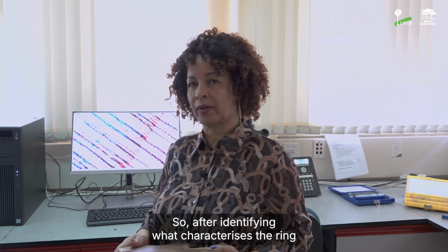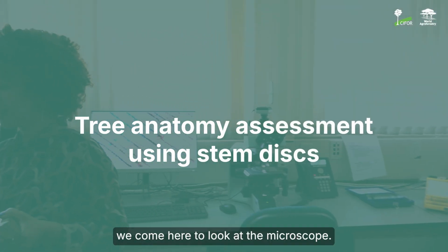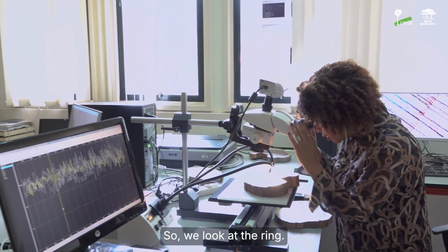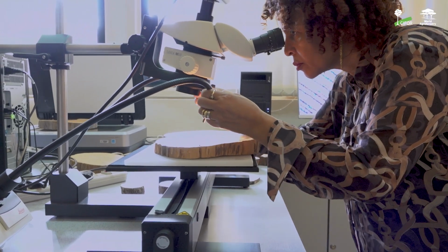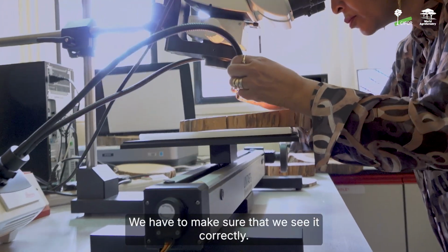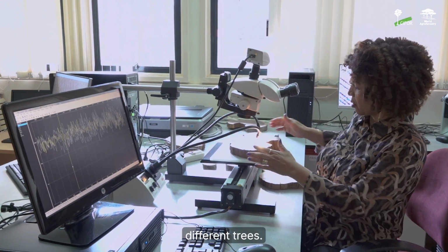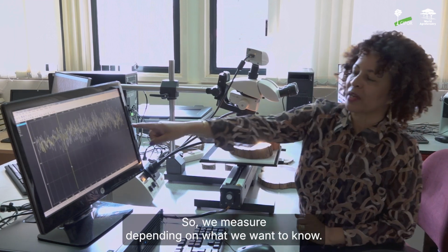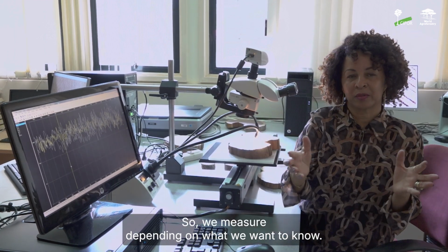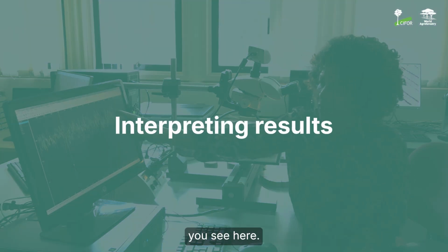So after identifying what characterizes the ring, we come here to look at the microscope. So as you see, we look at the ring. We have to make sure that we see it correctly. We measure different trees. I have one disc, I have the second disc, I have the third disc. So we measure depending on what we want to know. And then you have the up and down you see here.